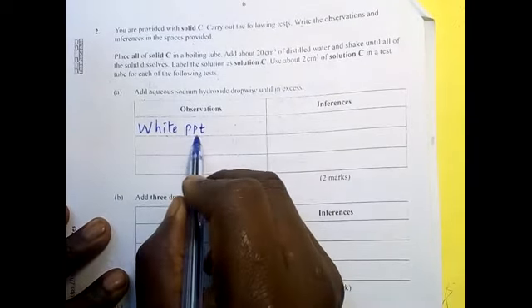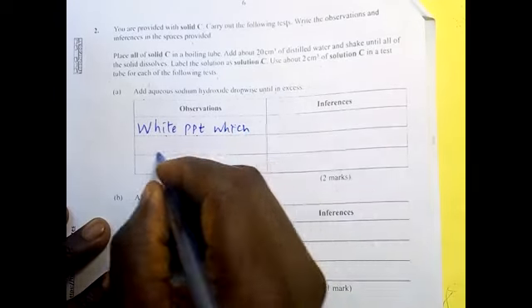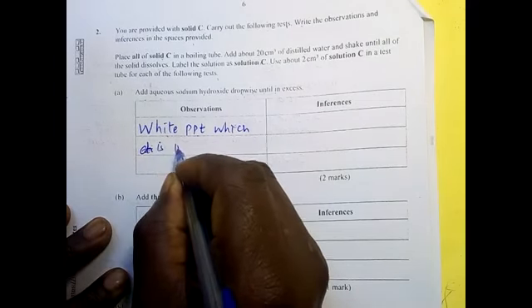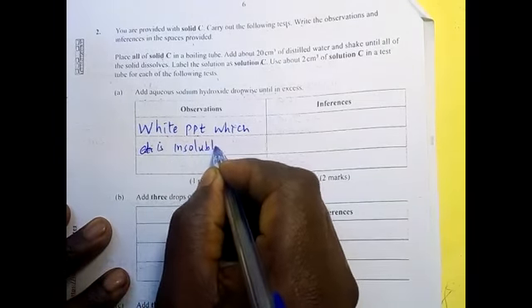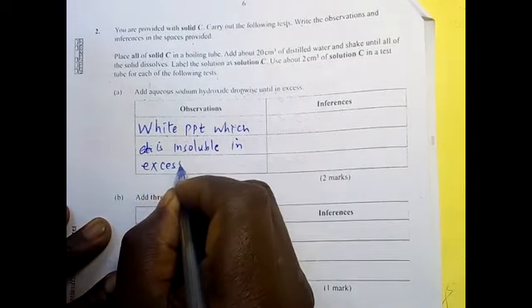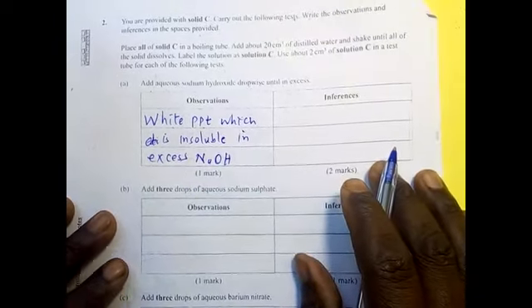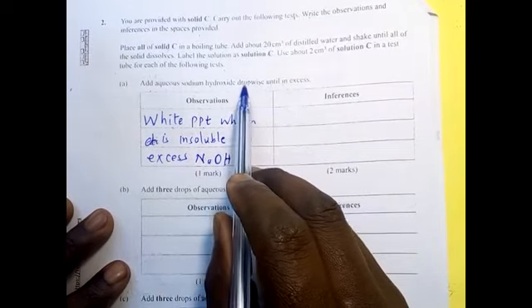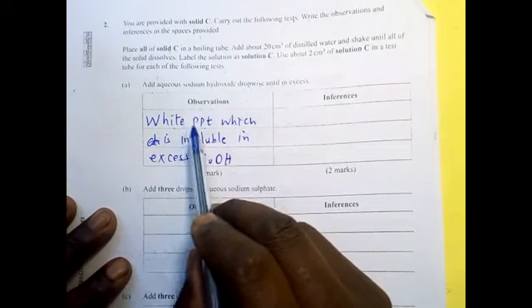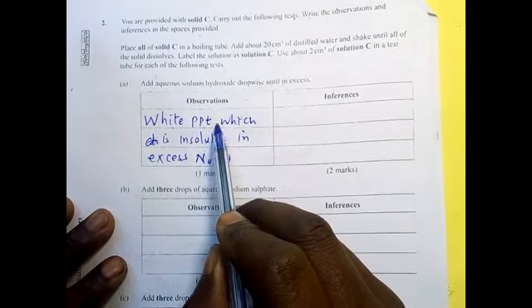It is insoluble; it does not dissolve in excess sodium hydroxide. So this is the expectation. Whenever you are asked to add sodium hydroxide dropwise and then in excess, first use 2 drops, make the observation, and then add in excess and make the observation.